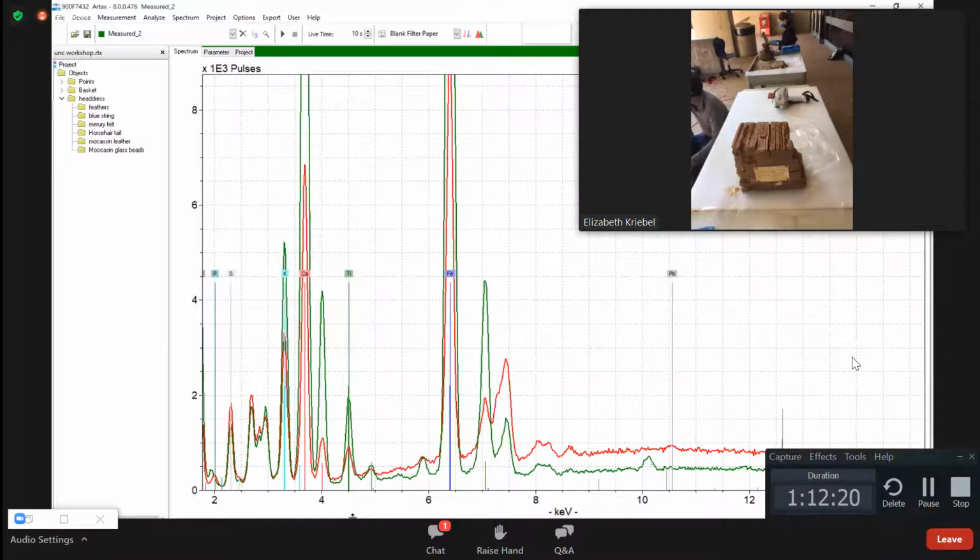But wherever it came from, just for those of you who are really into archaeological research, that titanium peak is highly anomalous. It's too much for what you typically see in a silicate. That titanium peak could be used to maybe identify the source of the hematite, because you want to find hematite with a similarly anomalous titanium source. Cool, excellent. Anything else on this we want to measure?